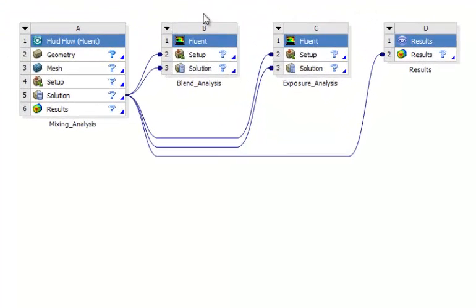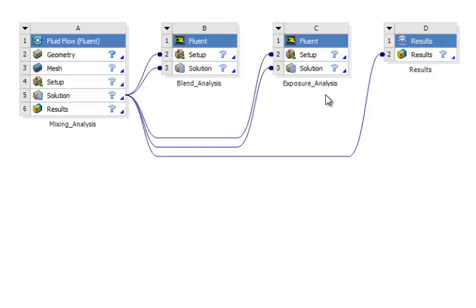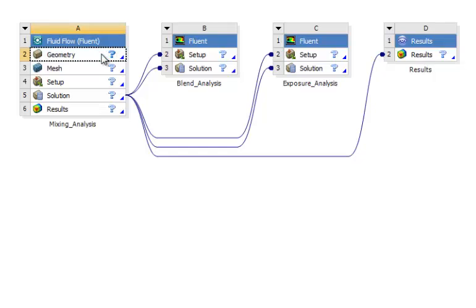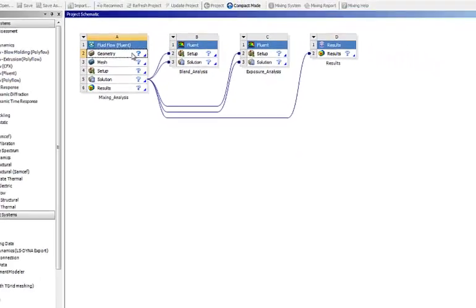Now we have a workflow that's already predefined for you with mixing analysis, blend time analysis and exposure time analysis simulation already set up for you. The only thing we have to do is actually define the geometry of the mixing tank.